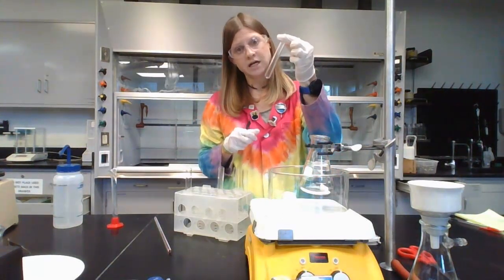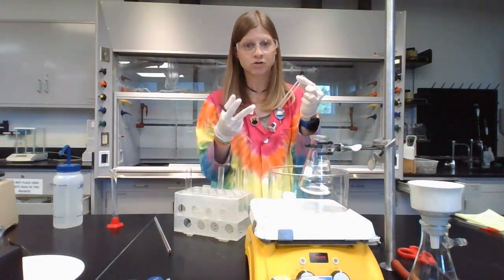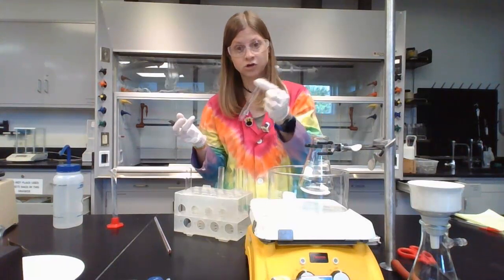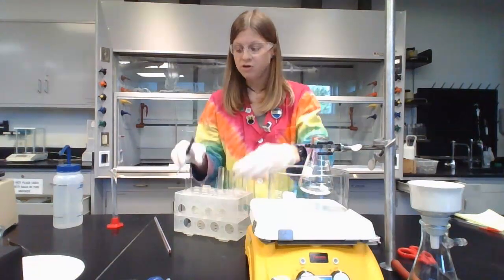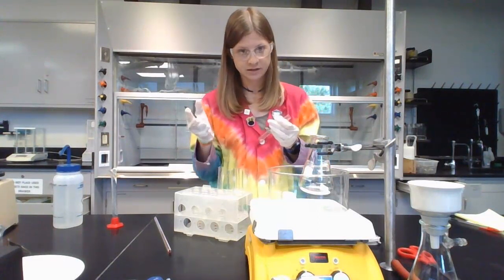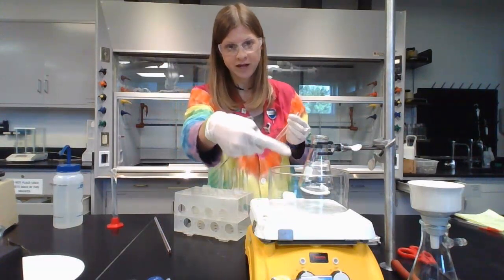And so then you're going to write down what you see, your observation. So it's going to be like a color. Did it turn green? Then write down turned green. It's just an observation. Okay, so you're going to do that for aspirin. Then you're going to do it for salicylic acid. So aspirin's the acetyl salicylic acid. Salicylic acid is the stuff that you just put into the Erlenmeyer flask to start your reaction.